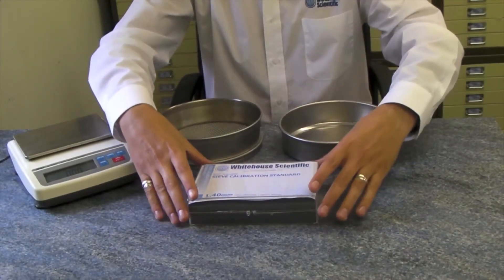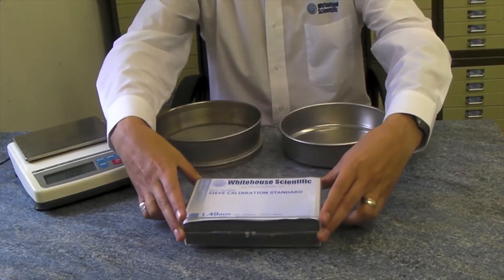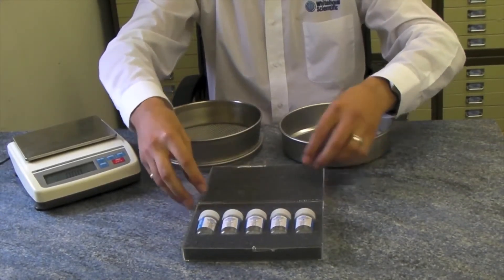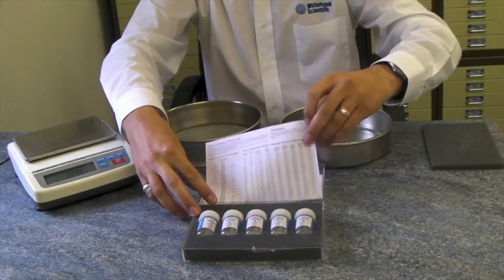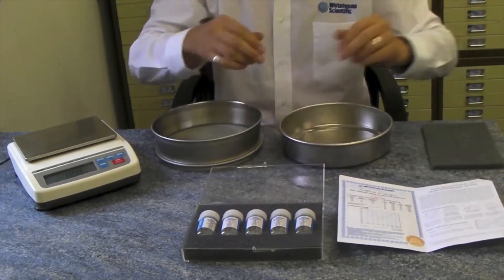Choose the calibration standard relevant to your sieve. White House Scientific have standards ranging in size from 20 microns to 3.35 millimeters. Each set of standards is provided with a detailed methodology, a certificate of analysis including a calibration curve, and information regarding tolerances to ISO and ASTM recommendations.